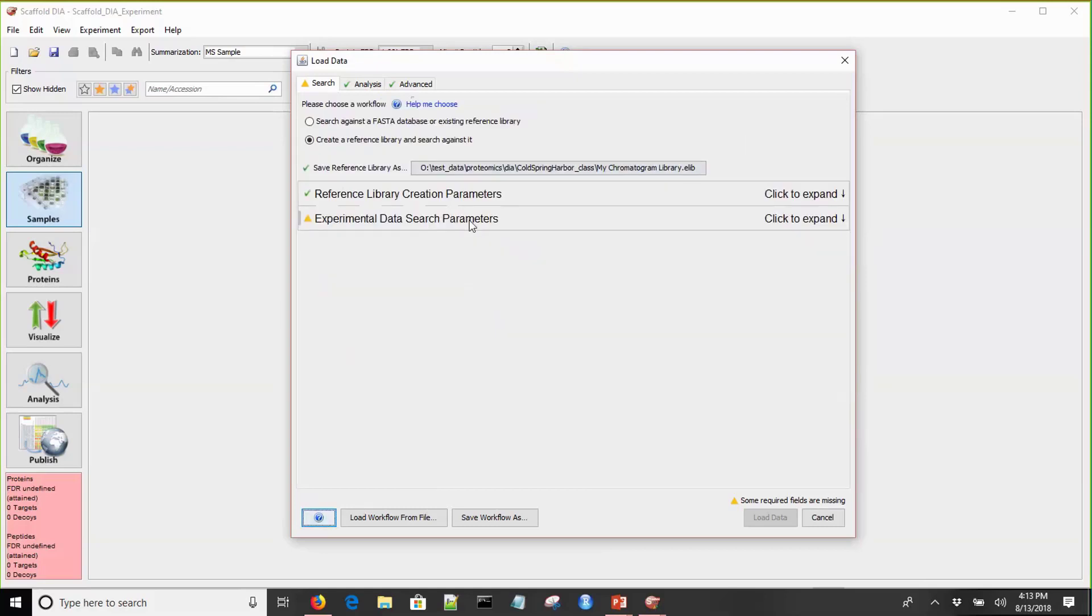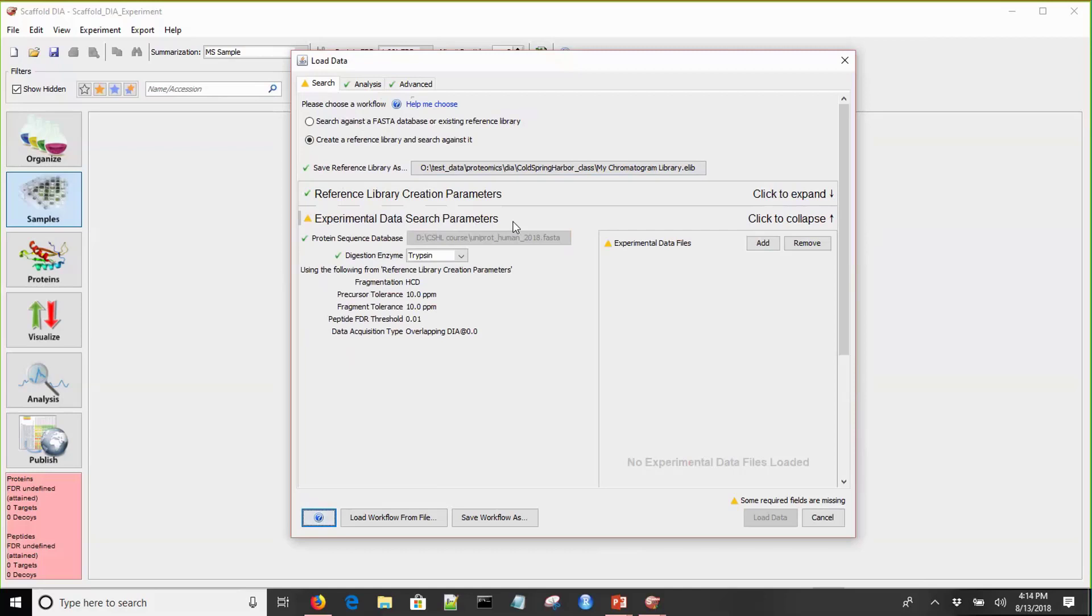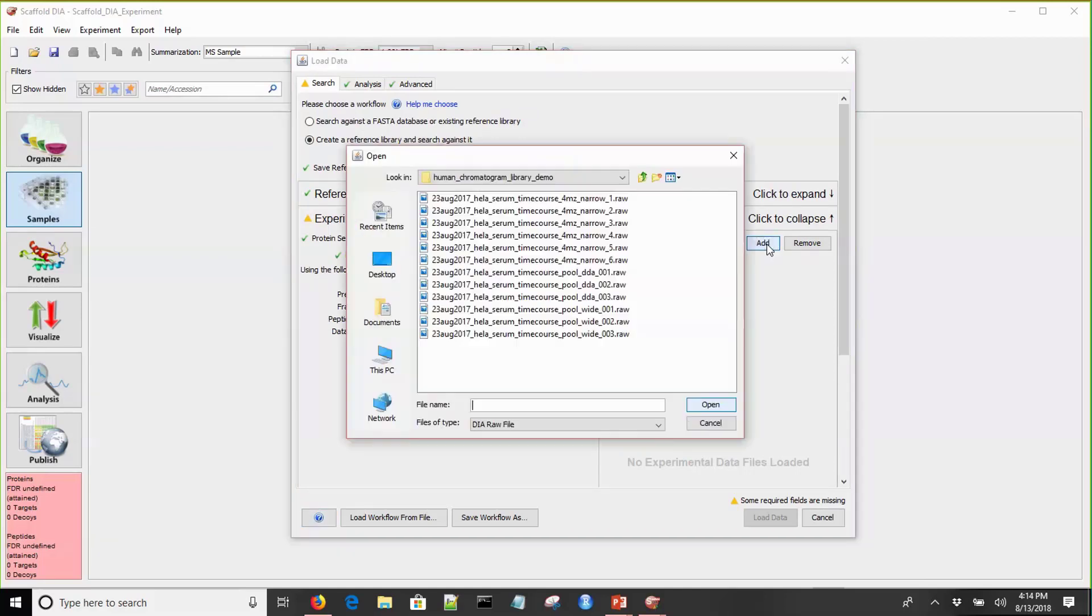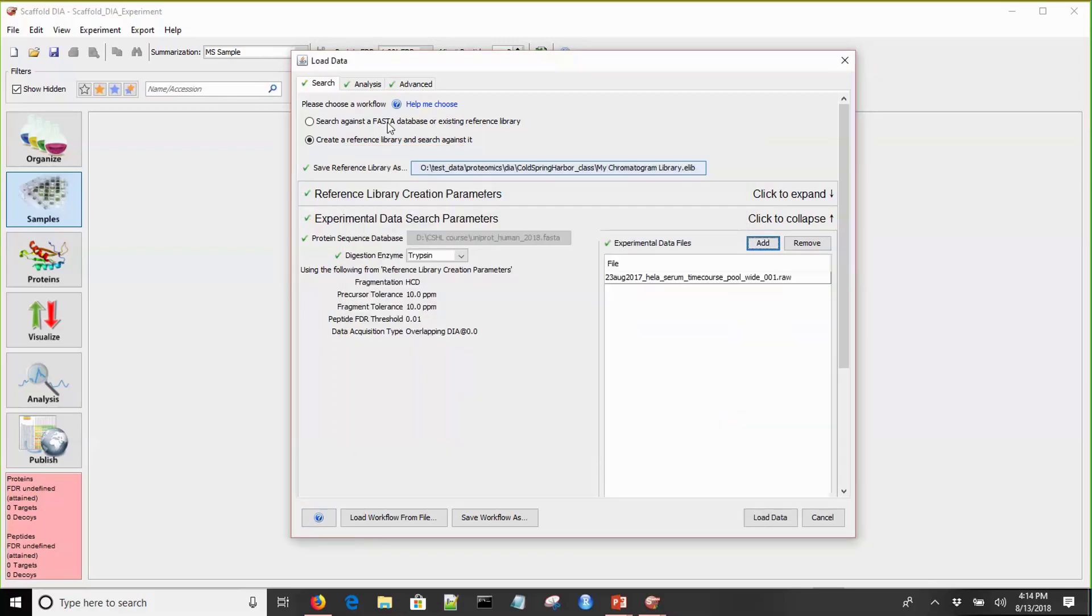We'll collapse that and expand our experimental data search parameters. This is where all the parameters are stored that control the experimental data search. Most of these are carried over. You want to make sure that your digestion enzyme is right. Now I'll navigate to the experimental data files.